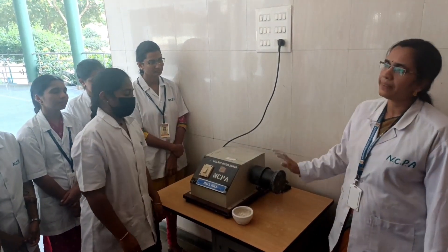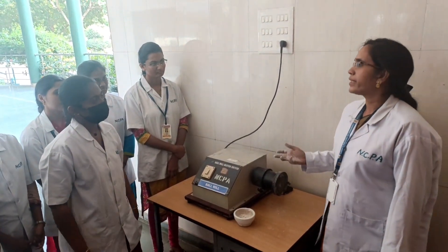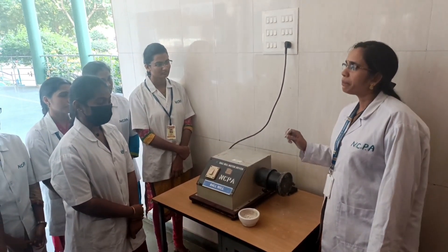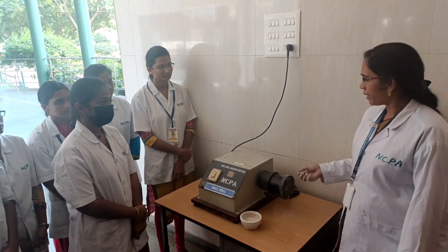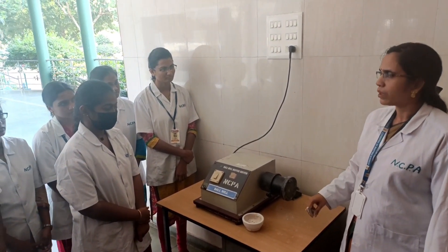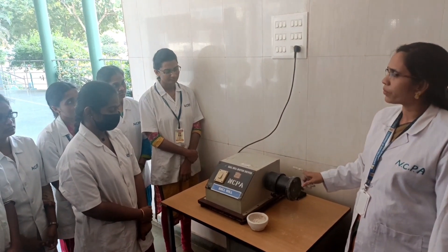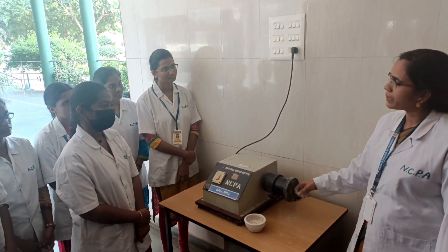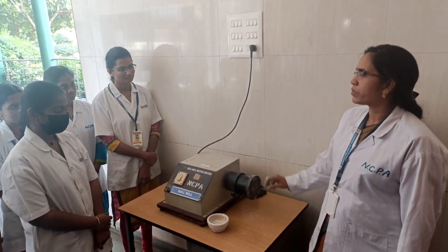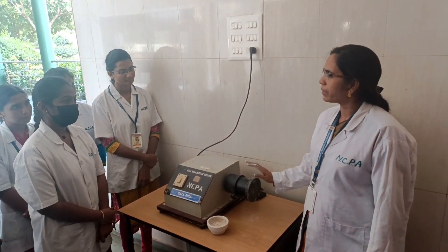This bulk material will be re-sized into very fine or nano-sized particles because of the attrition which is applied by these pebbles or stainless steel bars. After switching on this equipment, the bulk material present inside is converted into very fine-sized particles. This is one of the important unit operations that we should know.